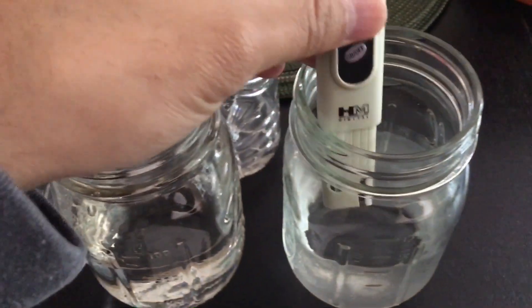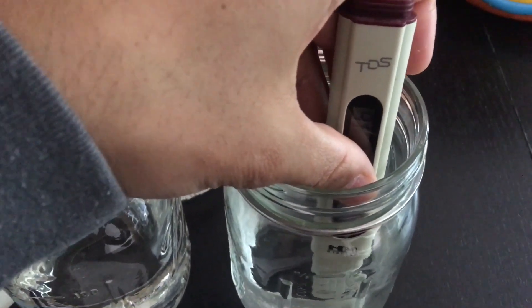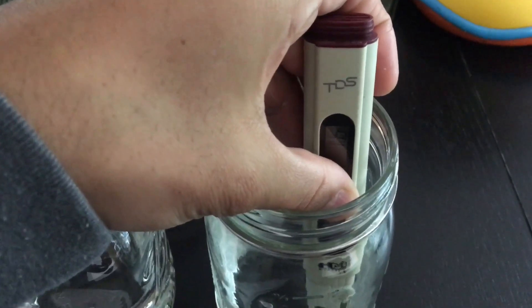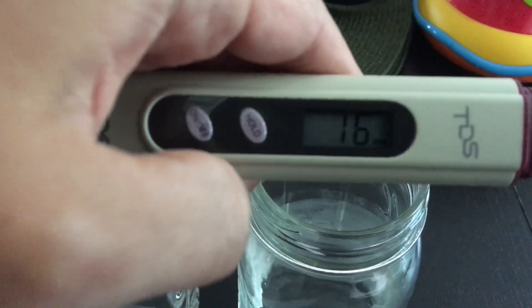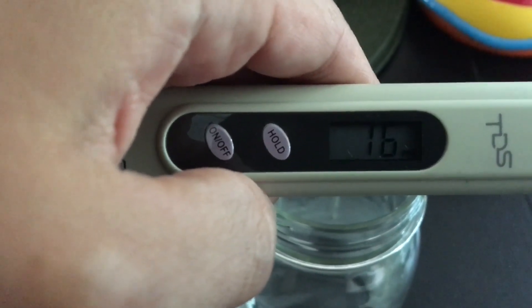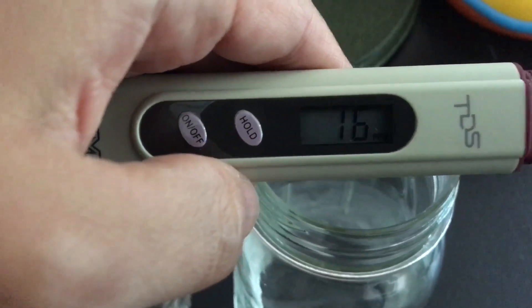Last but not least, we're going to try the baby water — what we give our son, mixed with juices, and have used for mixing powdered formula for a long time. The reading is 16 parts per million. So among all four samples: municipal water was highest, second was Trader Joe's, third was Poland Spring, and the winner in water quality is the baby water at 16 parts per million.